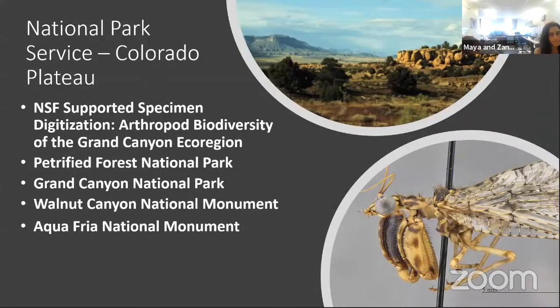Thanks, Maya. I just wanted to talk about some of the projects that are ongoing in our lab. One of our main missions in this imaging lab is to account for the biodiversity of insects in the whole Southwest. We're in an excellent position for doing entomology. Because of the imaging equipment that we have, we can make a name for ourselves by collecting from unique regions nearby and posting those images onto public databases like the ones Maya just mentioned.